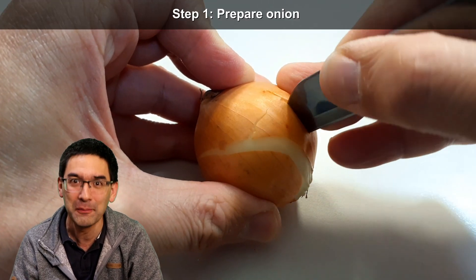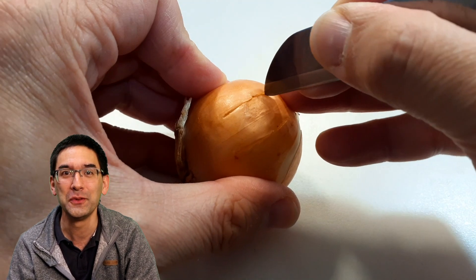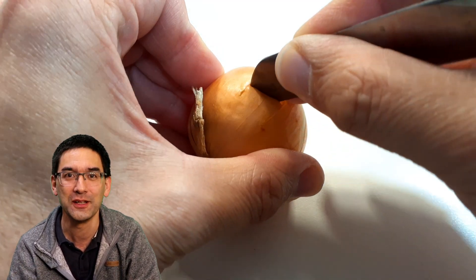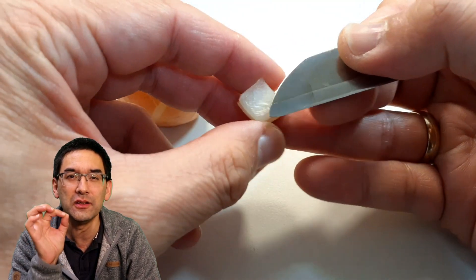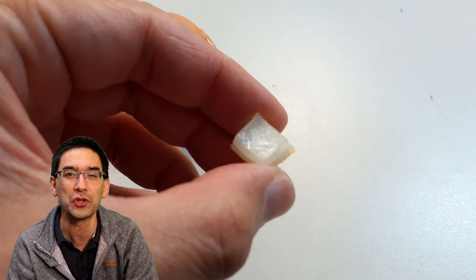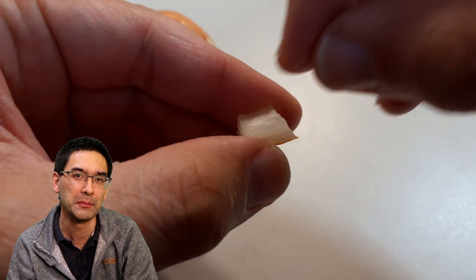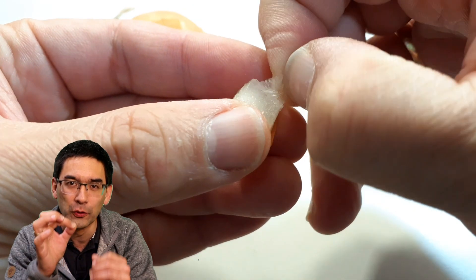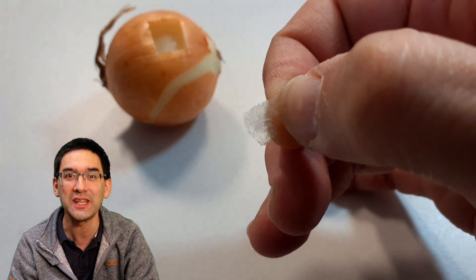Here's our victim that I'm going to be staining — the onion. I've cut out a little square using a knife, as you can see here. Between the layers of the onion there is the onion skin, and this onion skin is approximately one cell layer thick. I'm simply using my fingernails to carefully peel it off, and this onion skin is what we're going to stain.